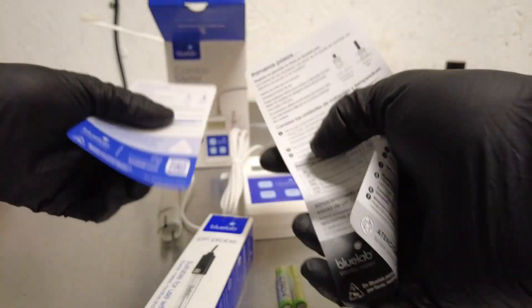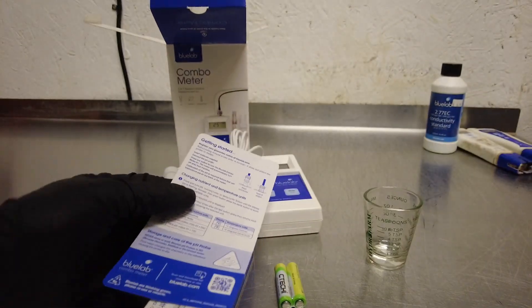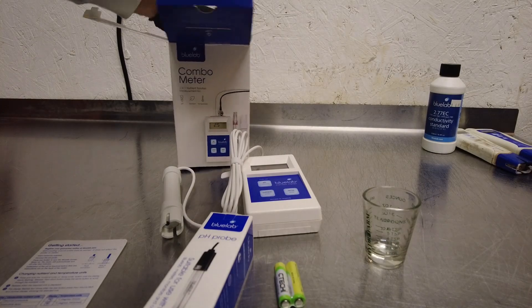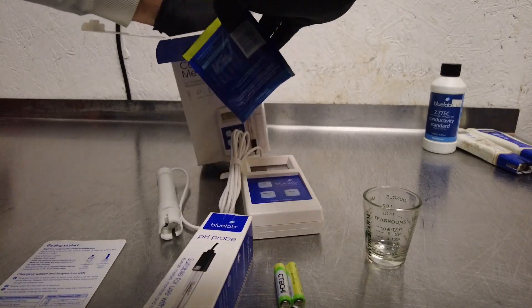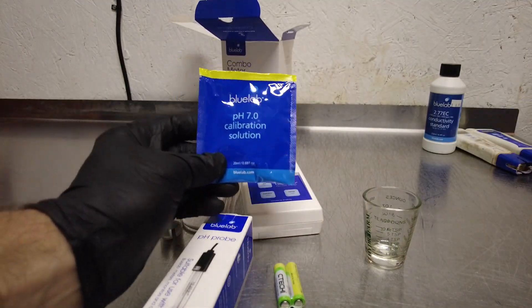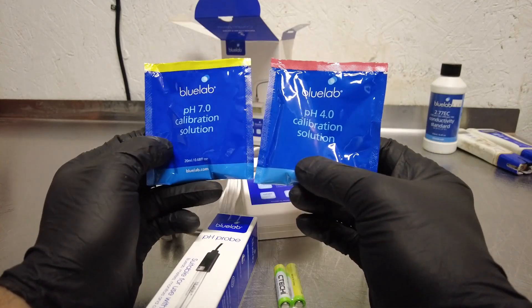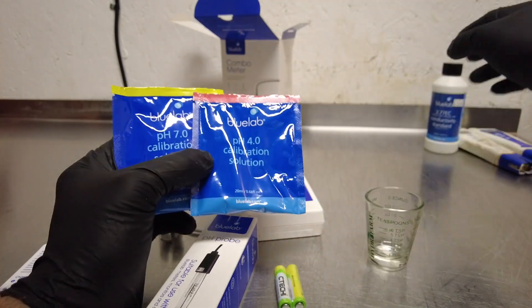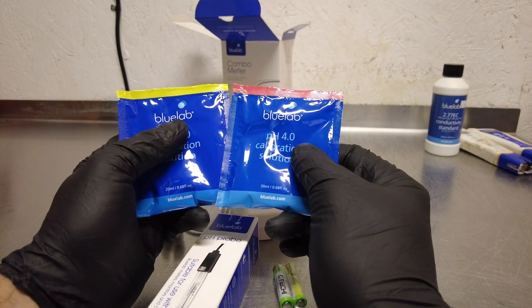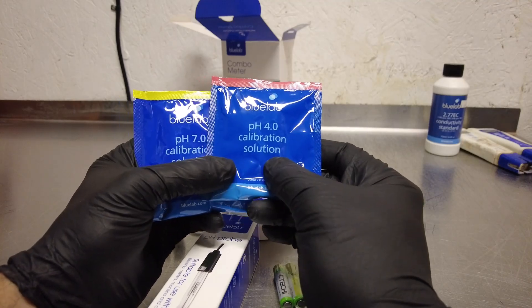Also inside the box you've got your Spanish and English manuals. Inside the box you also have both your pH 7 calibration solution and your pH 4 calibration solution. You have to calibrate this pen before you use it for the first time. I'd recommend having larger bottles on hand because you do want to recalibrate these probably about once a month — it's really simple and takes less than two minutes.